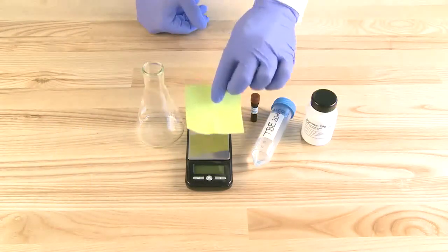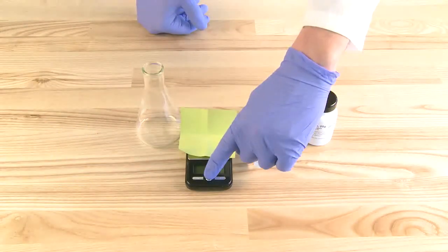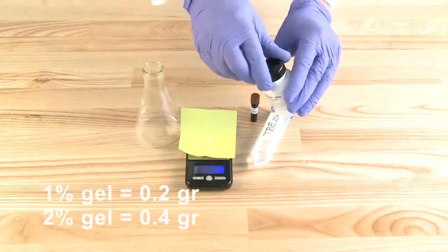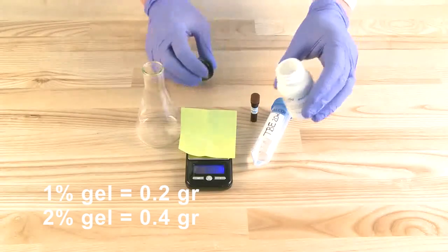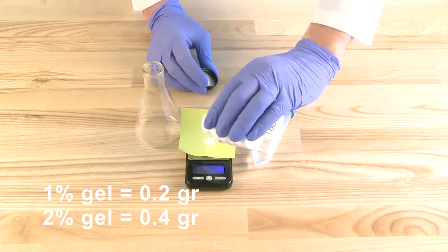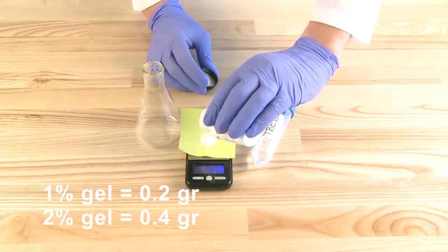Start by placing the weighing boat on the scale and setting it to zero. Measure an appropriate amount of agarose. For a 1% gel, weigh 0.2 grams of agarose. For a 2% gel, weigh 0.4 grams of agarose.